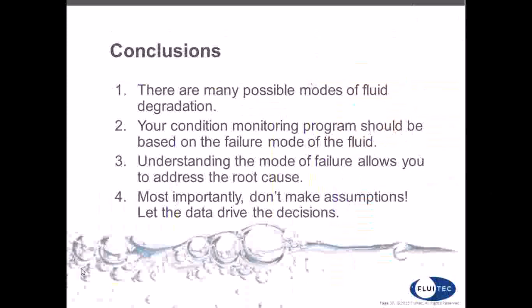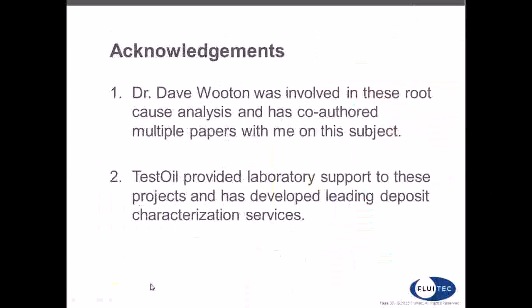Okay, that sounds great. So yeah, I think that this can be a very complex subject, but I think the big takeaway is that there is value in your deposits. Capture it, send it to your lab, and the lab, your oil analysis lab, can really help give you a lot more insight into the quality of your oil.